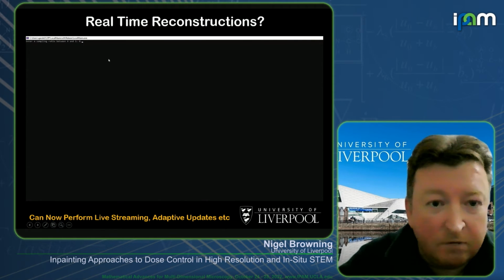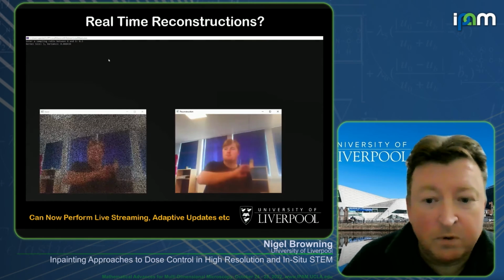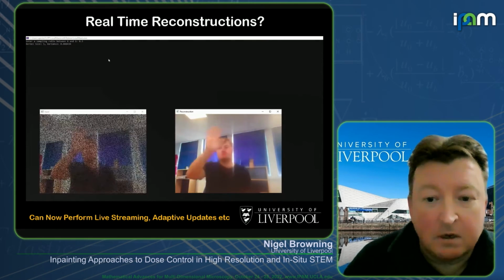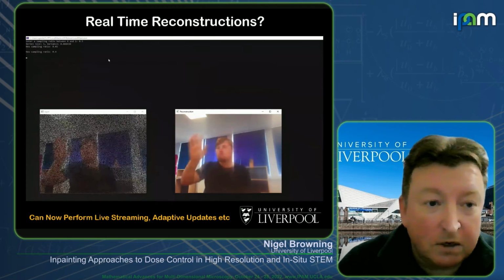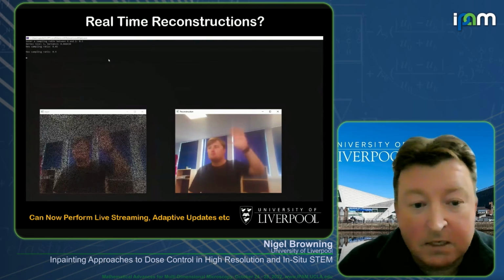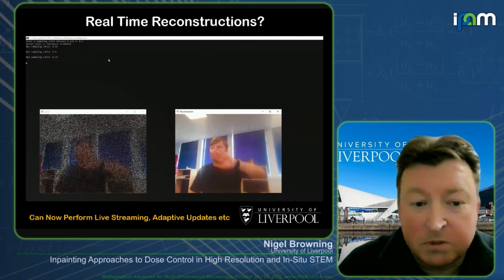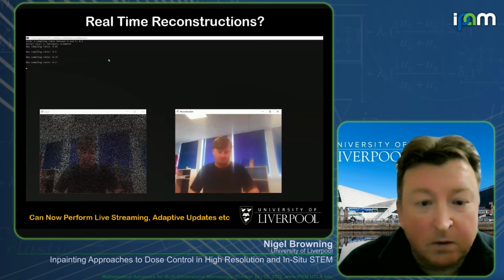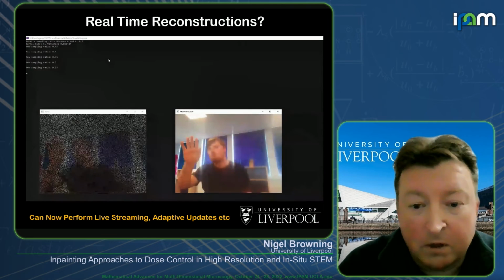Okay, here is an example of a webcam. So this is a color image, and doing a very simple reconstruction. This is Alex, the student who codes all this stuff up. The left-hand side is our subsampled webcam. The right-hand side is the reconstruction. And you can see how long it takes the reconstruction from the difference between the images that you can see going subsampled. And what's happening here is the subsampling rate is going lower and lower.